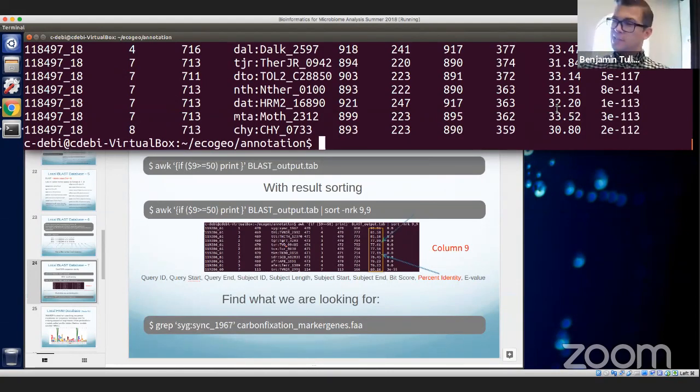If you can see right here in this little bit of area that's visible, it looks like a lot of the matches that we find are in that 30% range. And that 30% range, like I said, doesn't have a lot of biological meaning all the time. It can happen just by the fact that a lot of proteins look like each other. So even though there is a match, it might not be a strong match. Once we get into that 50% identity range or something higher, into the 90s, then we can start feeling like this is a correct identification of the proteins that we're working with.